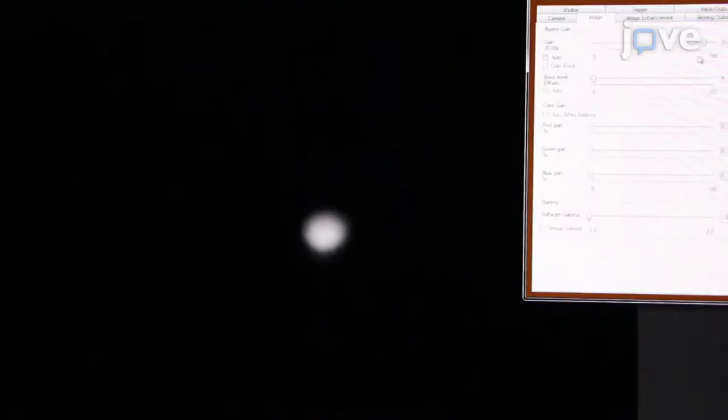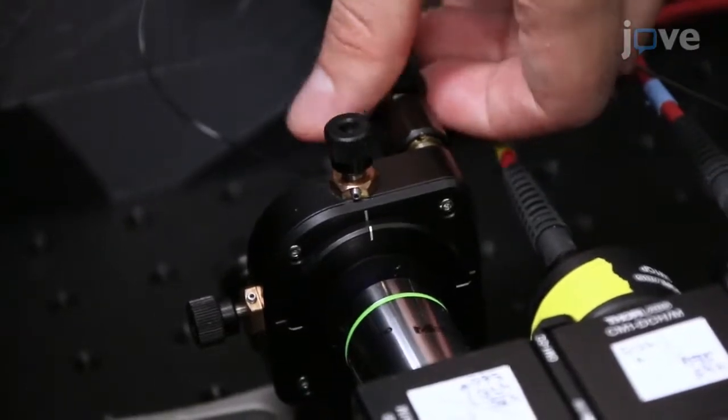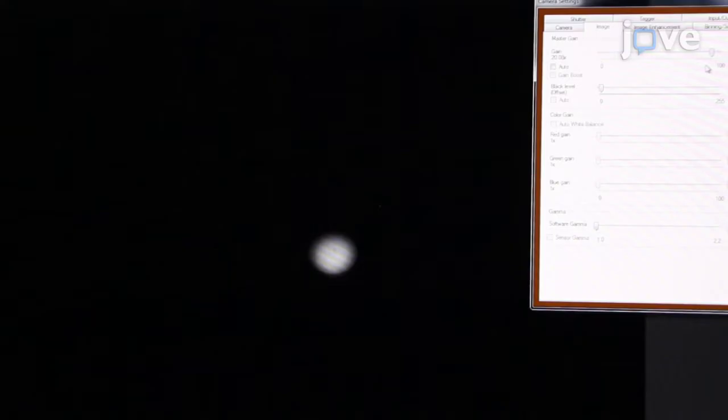Advance the 5-axis translator towards the objective, ensuring that the 470 nm light is centered on the fiber at the SMA or FC end of the patch cord until an image can be resolved on the camera.